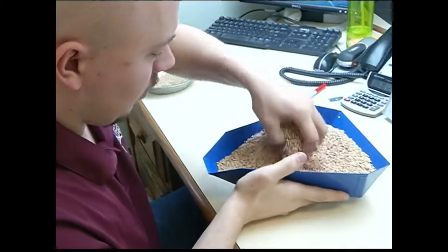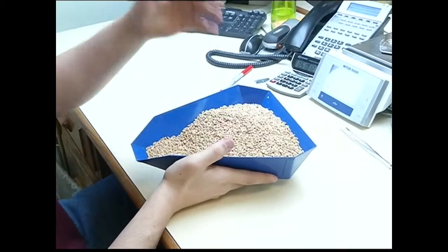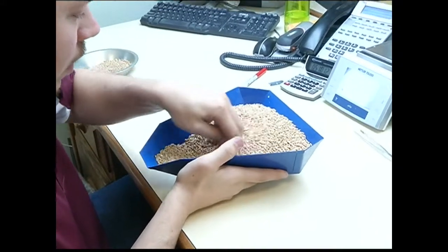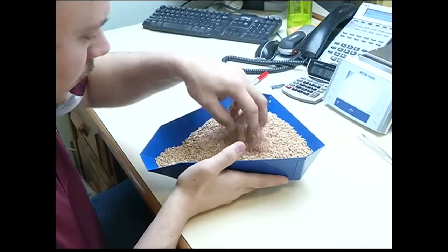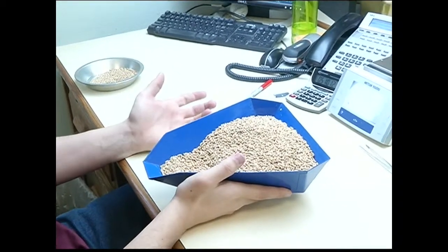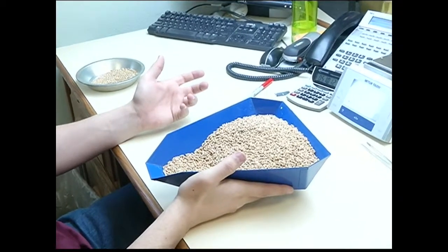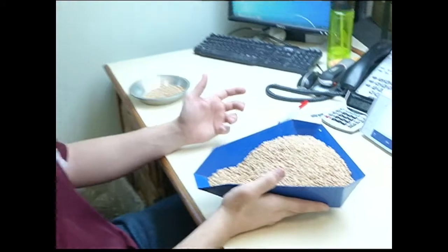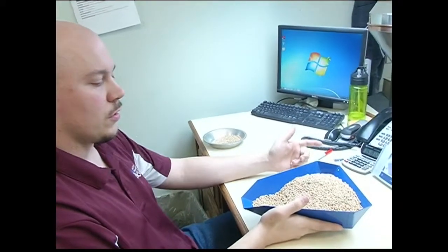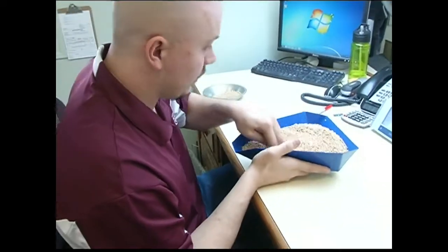All right. And then my 1,000 gram portion, I'm gonna go through this sample for stones, rodent pellets, fertilizer pellets, anything that shouldn't be in a good quality wheat sample. First thing I'm gonna do is just kind of mix it up a little bit, and I'm gonna do an odor test. I'm gonna smell for musty, like a earthy odor, a sour odor, insect, and a COFO, which is a commercially objectionable odor, like skunk. You could also have fumigant, insecticide. That's stuff that we don't want to eat.